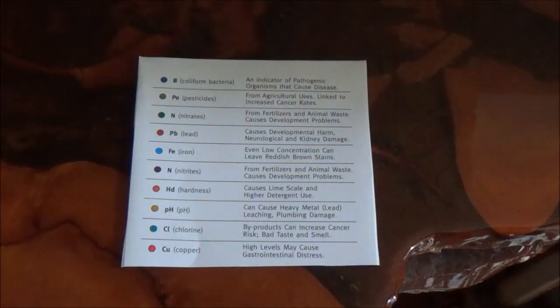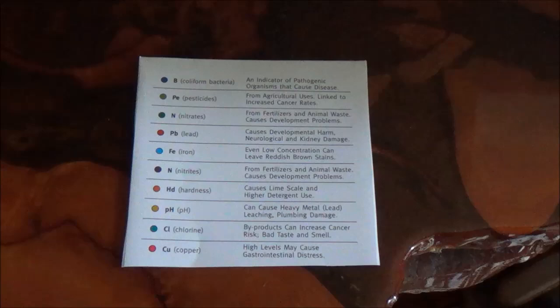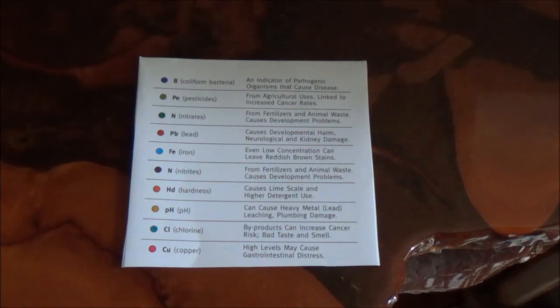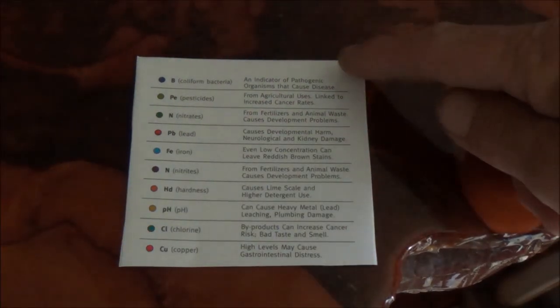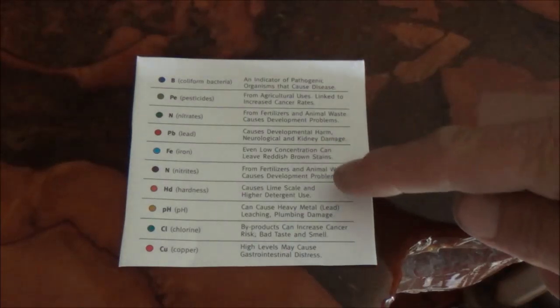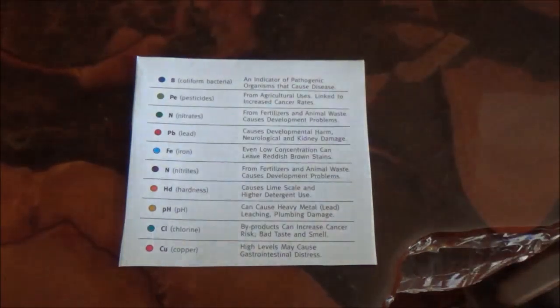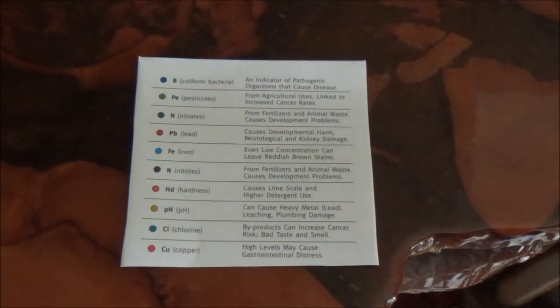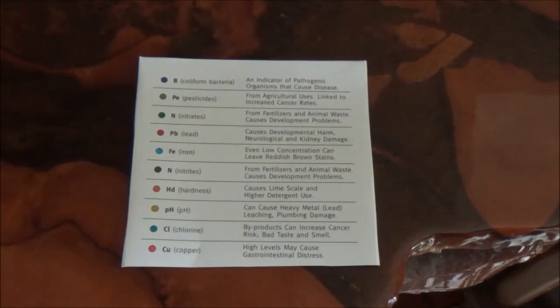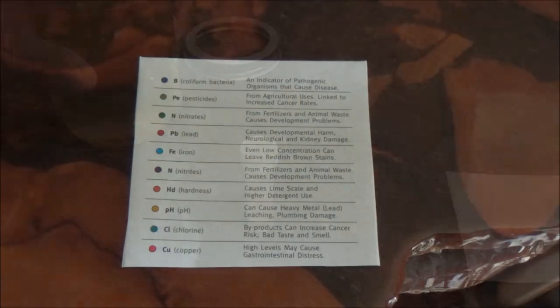This is what this test tests for: coliform bacteria, pesticides, nitrates, lead, iron, nitrites, hardness, pH, chlorine, and copper. With this test kit, it goes right down here and tells the different things that it does to the body and everything like that. So it's an interesting test. I'm mainly interested in the bacteria, but we'll go through and test all of these.